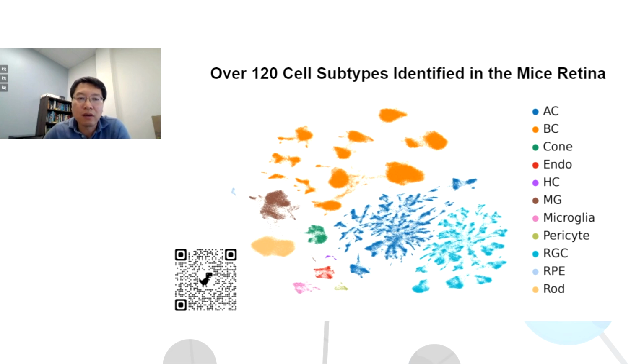So single cell RNA-seq profiling has been done on mouse retina, and this is the latest map representing the atlas. This is composed of about 300,000 cells of RNA-seq, and based on this data, it can be divided into 120 cell clusters. Most of them correspond to distinct cell types. They have different colors as different classes, where each cluster is a different cell type. So this is enormous data, and that'll be really useful for the community.